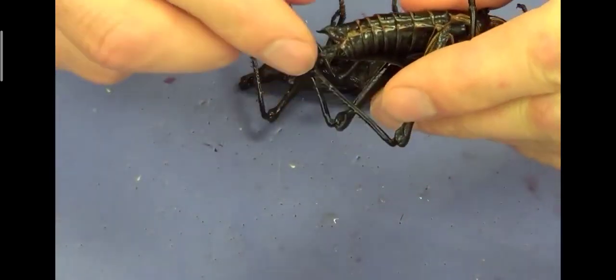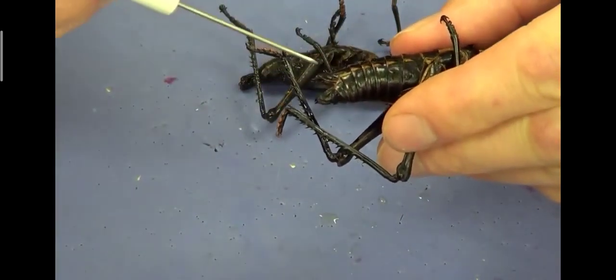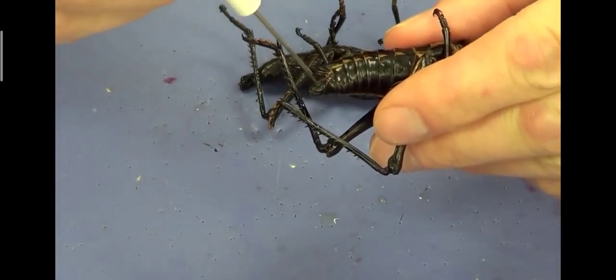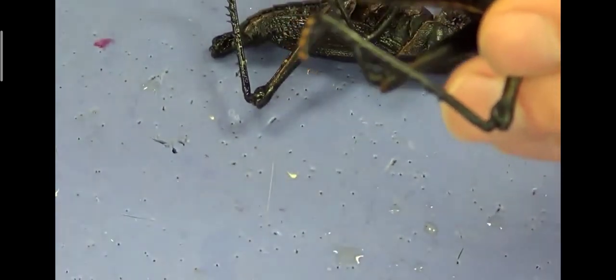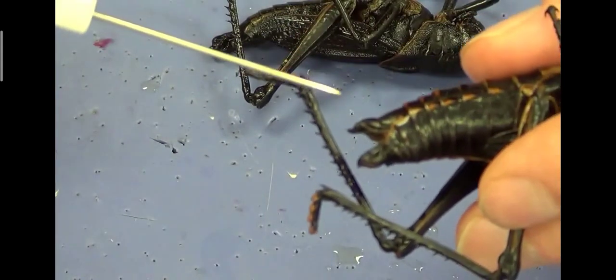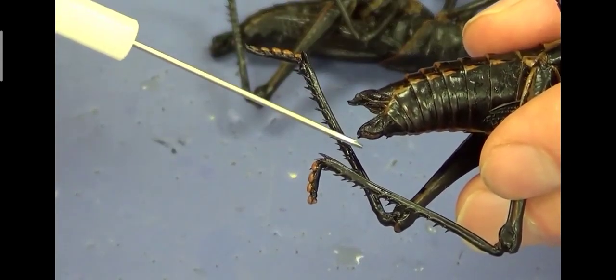First of all, here this part is termed the ovipositor. Okay, this is the female part, and this is the only part which helps in identifying whether the grasshopper is male or female. Now you can observe over here, this is the opening.